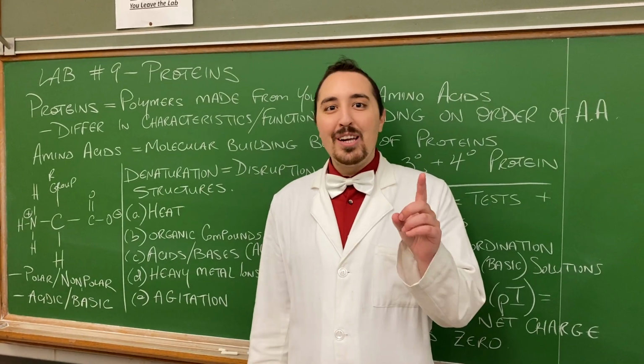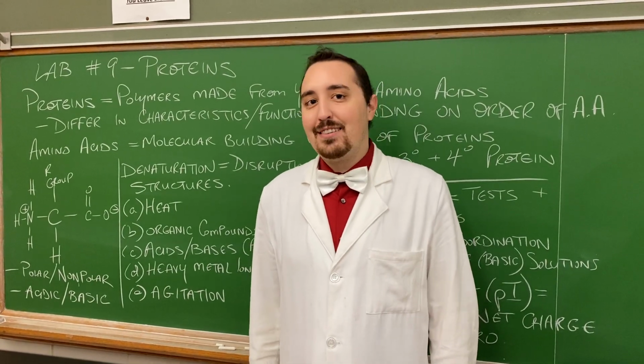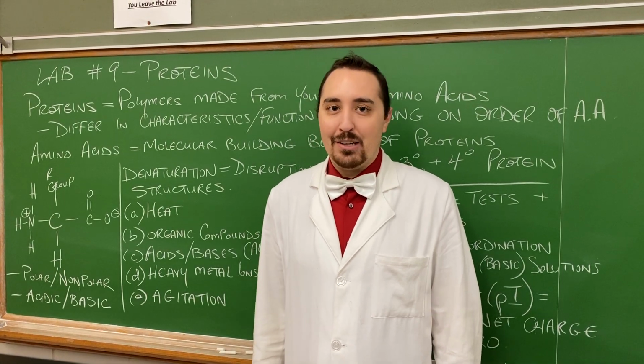Hey guys, this is Dr. Marino. We're looking at the Virtual Proteins Lab. It's lab number 9 in your lab manual.